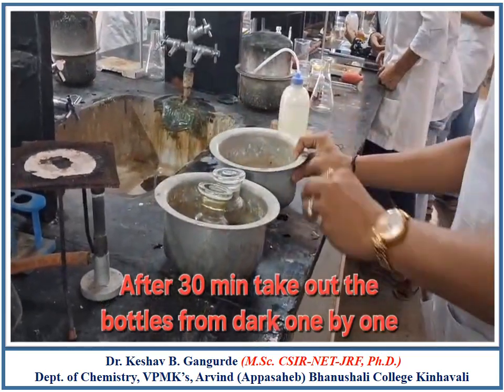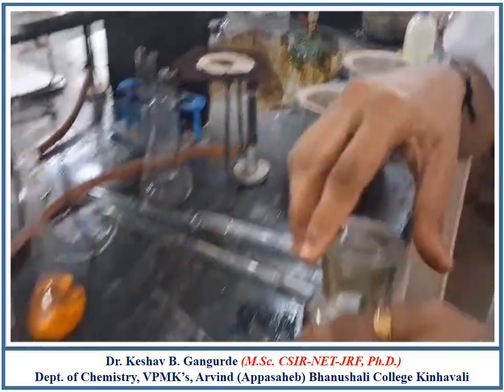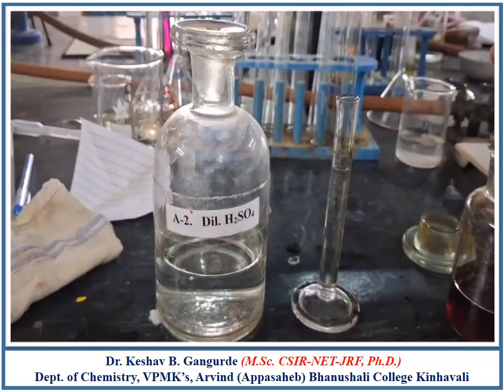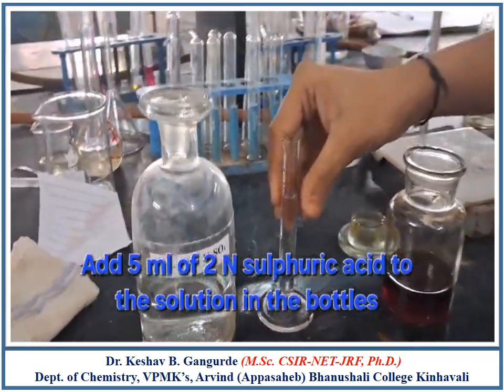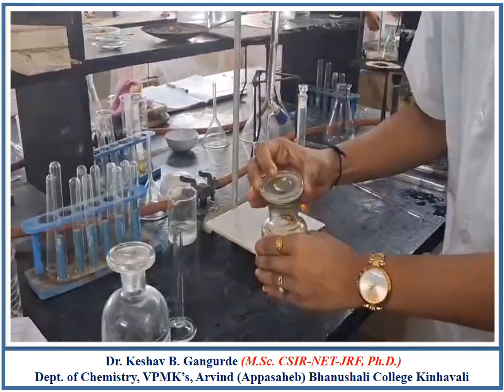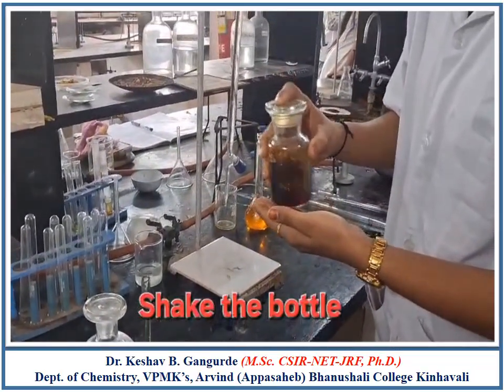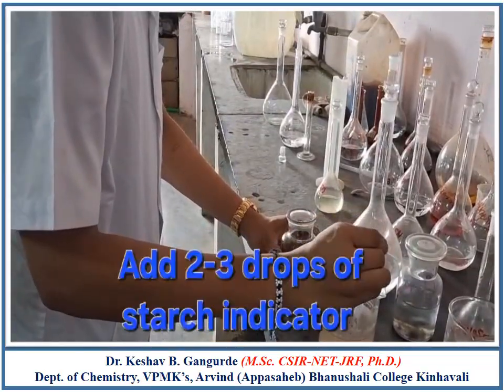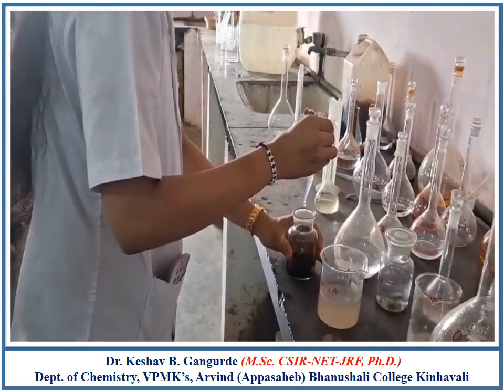Now take out the reagent bottles from the dark. To it add 5 ml of 2 normal H2SO4. Shake the bottle vigorously. Add 2 to 3 drops of starch indicator to the same bottle.